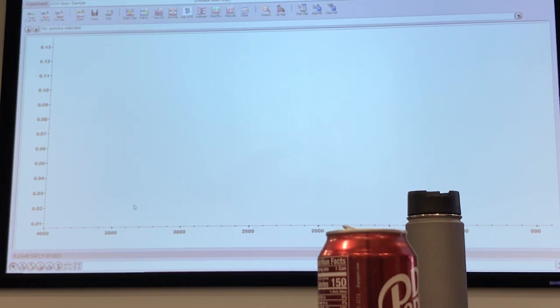And so that raw match score, the first match score, is just simple arithmetic, right? It's not like a multiple regression. It's not like a principal components kind of thing where you're trying to partition. No, it's a simple correlation, point to point. Right, which is probably why you're getting off. Yeah, I was getting confused. The assumption was that it's actually looking and accounting for this and that, but it's simple.